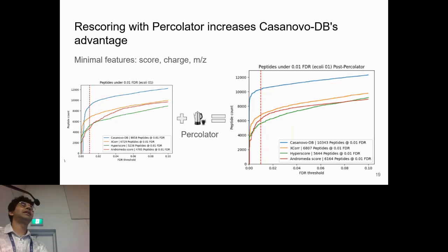Yeah, so the mzTab output does have those scores in a list aggregated. So if you want to run any experiments, you could just run the tool, and there's a column that just has those scores right there. Personally, the only thing we did with that list of scores was collapse it into a total score so we could do some FDR control tests. But I'd totally be curious to talk about what we could do with that after. Yeah, well done. Thank you.